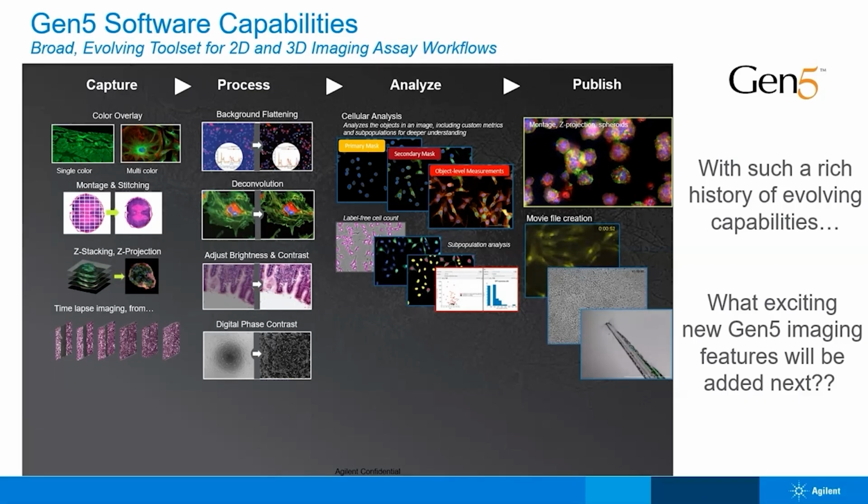We want to keep our ear to the ground to hear what researchers are doing and what they really need today, and then continue to add tool sets into Gen 5, holistically, that really support them and enable them to maximize the value of the imaging platforms they have.